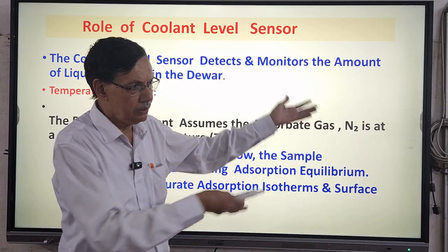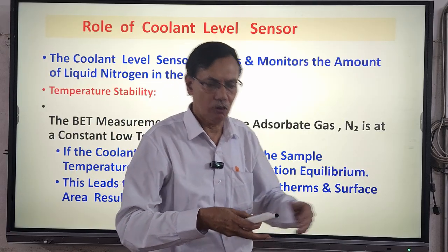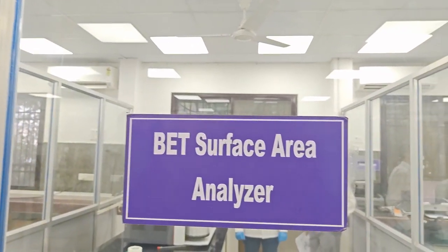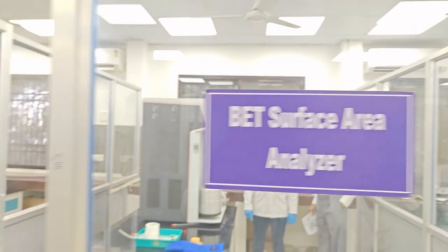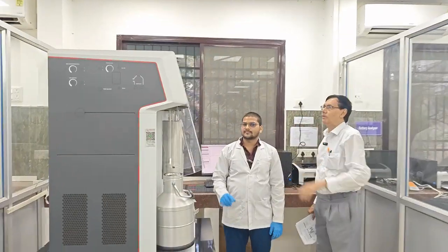So please come with me, go to the DST PURSE lab, which is a very sophisticated lab for experiments. Please come. And you just zoom in, Anton Paar.